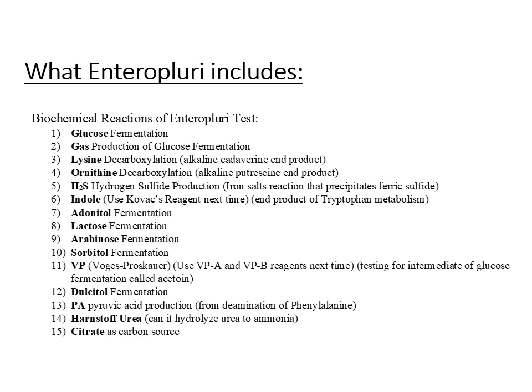You do not have to memorize these 15. You will always see them listed out. I just wanted you to be able to recognize that these 15 processes that you're checking for are metabolic reactions, but you're not memorizing the names. You will always be given them. They're on the side of the tube.